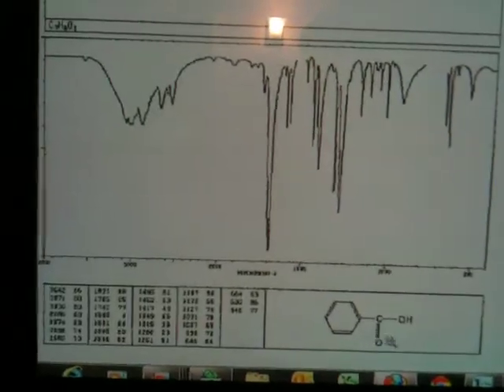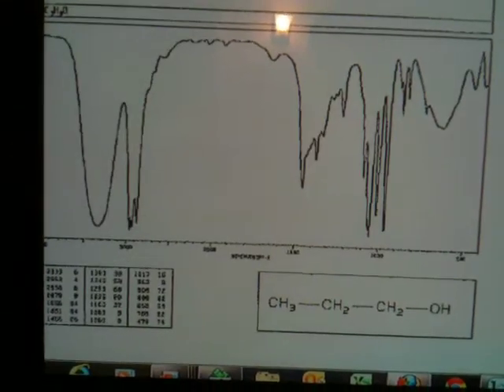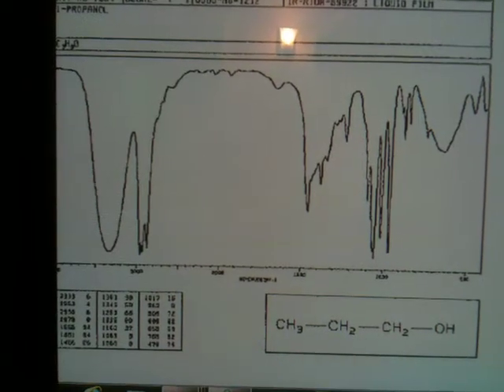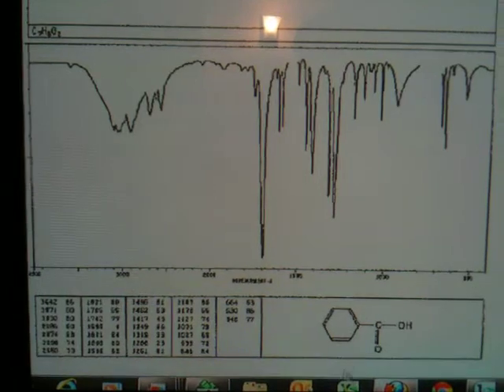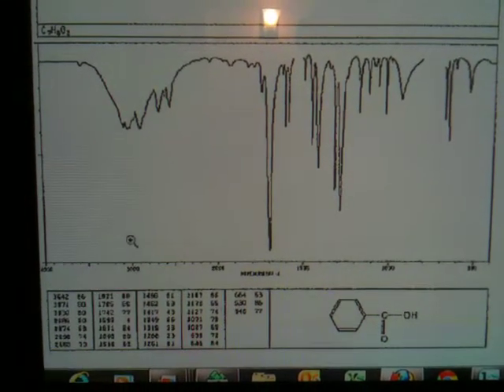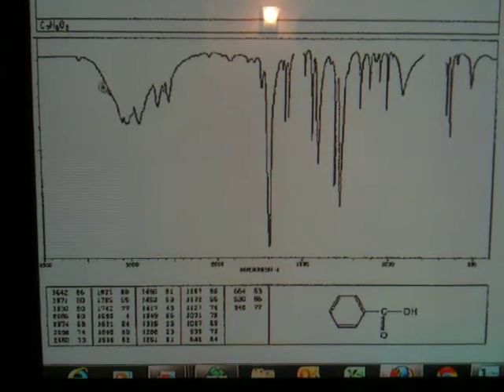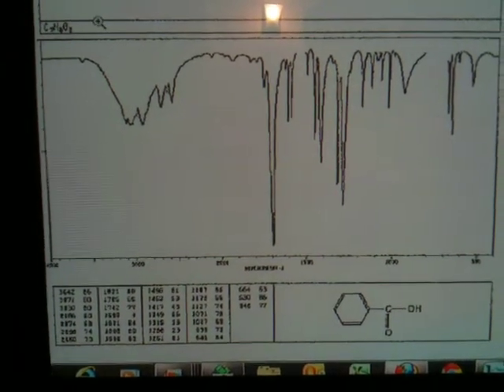And this OH is really different. Let's go back and look at it. Really different from the alcohol OH. Okay? Being next to the carbonyl completely changes the landscape that you see in the IR. All right, so this OH is in this region, but it gives this very broad kind of multiple humped peak. Okay?